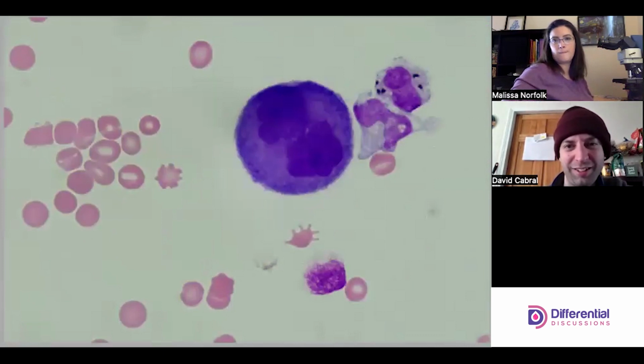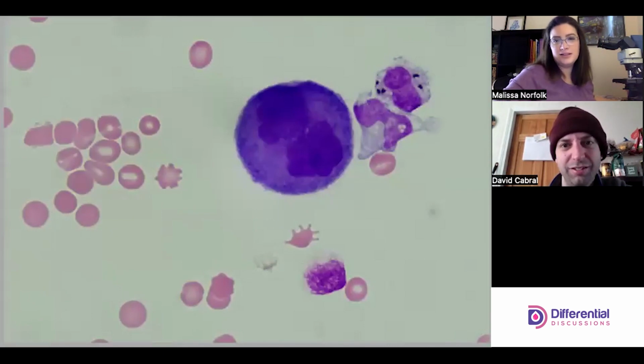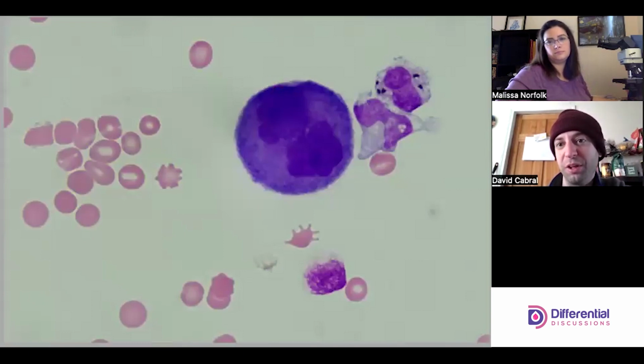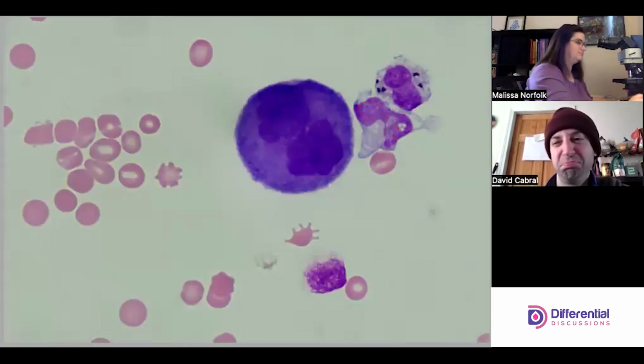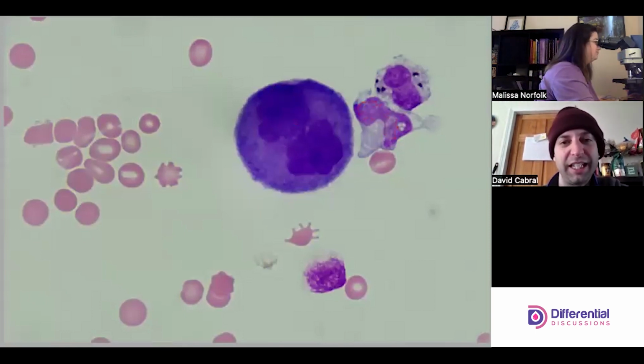Almost like black. And this is with the microscope in focus, with adequate light. So here's a nucleus with all the same genetic information. Actually not, right? Maybe, but you just have these dramatic differences. Listen to the stain.